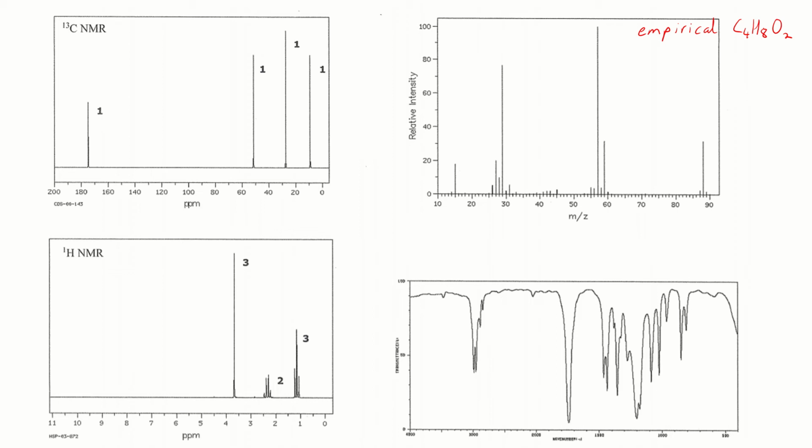So I'm going to work through this one as an example. I don't really have much space. So when you're doing it on your assignment, you should be putting a bit more into it in terms of stating the peaks and what groups they correspond to and such, and maybe drawing them out a little bit more.